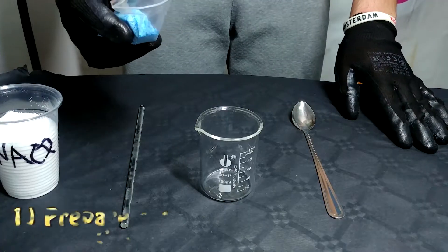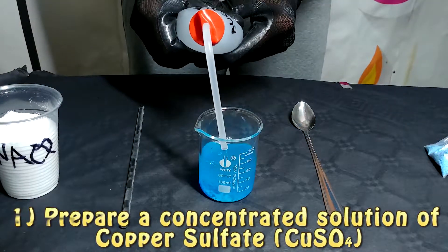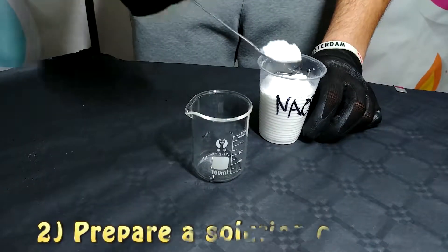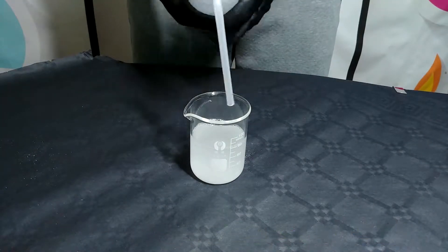For this experiment we are going to do three things. The first one is a reaction between copper sulfate and aluminium. We first tried putting just one sheet of aluminium foil, but we observed that it wasn't strong enough, so in the next experiment we are going to use three sheets.